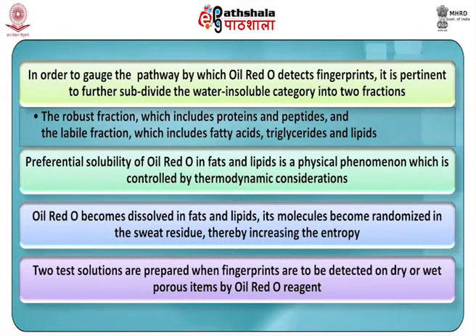Then we have come to learn that when oil red O becomes dissolved in fat and lipids, its molecules become randomized in the sweat residue, thereby increasing the entropy. And lastly, we have learned from this chapter that two test solutions are prepared when fingerprints are to be detected on dry or wet porous items by oil red O reagent.